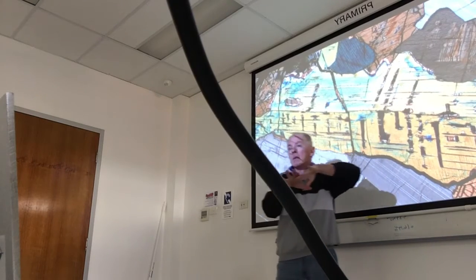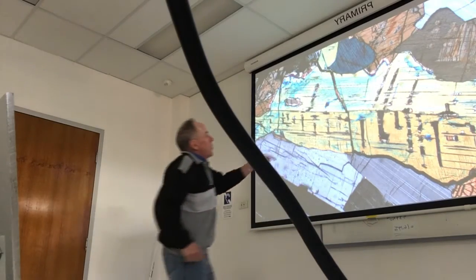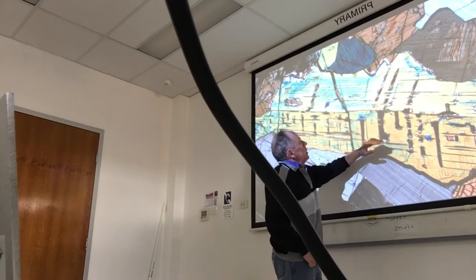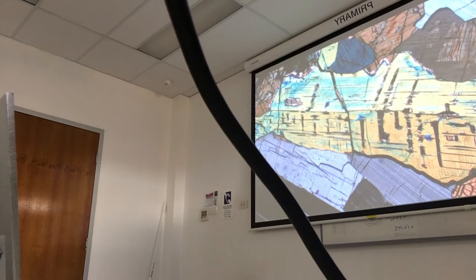Remember, a twin is a change in the crystal lattice orientation, so the cleavage changes accordingly. This cleavage orientation here doesn't change, but the second one does. Okay, so that's classic herringbone texture exsolution in what was this subcalcic augite.